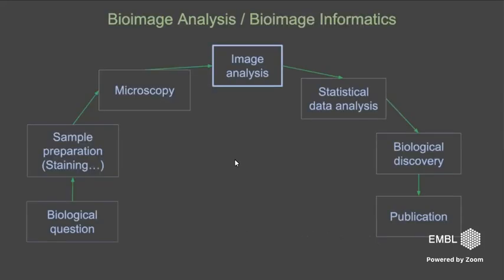Okay, so bioimage analysis. Another word, by the way, that's becoming popular now is bioimage informatics. So the usual workflow of an experiment you see here on the screen, involving microscopy and image analysis and hopefully a publication in the end. Let's say the core business of bioimage analysis would indeed be the image analysis part, but to do this job properly, you have to consider all these aspects.